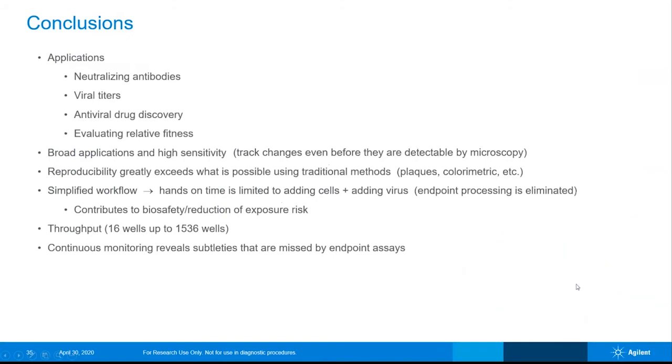Finally, when you combine the impedance with imaging, one of the benefits is that this really maximizes both the sensitivity and the specificity. So with the ability of impedance to look at changes in cell number and size and attachment strength and barrier function, as we've already said many times, there's very high sensitivity associated with that.